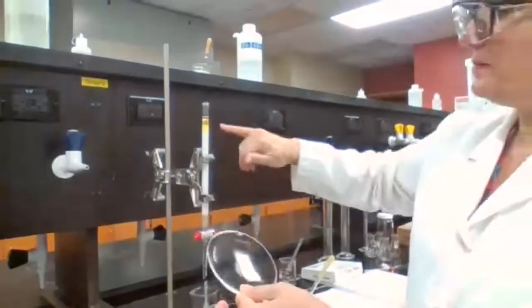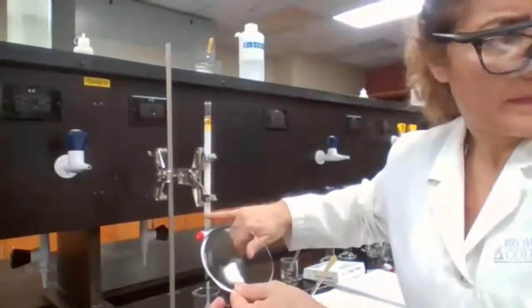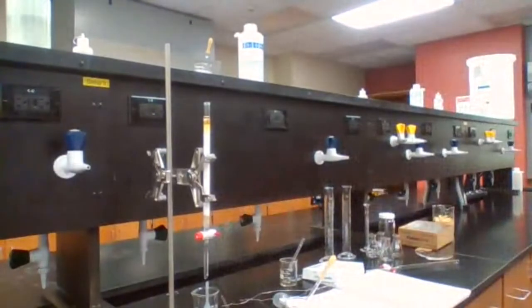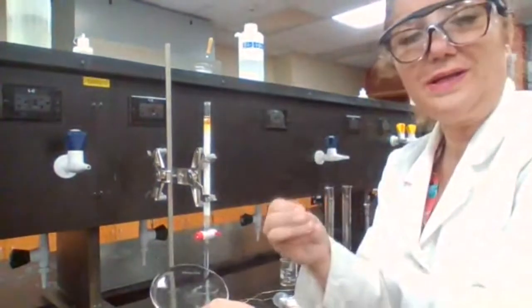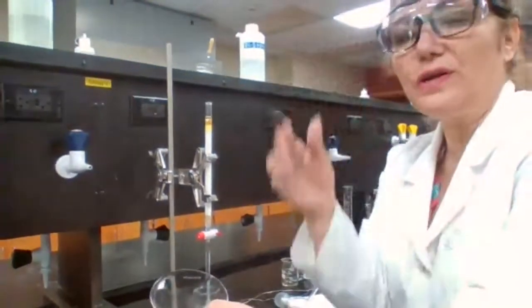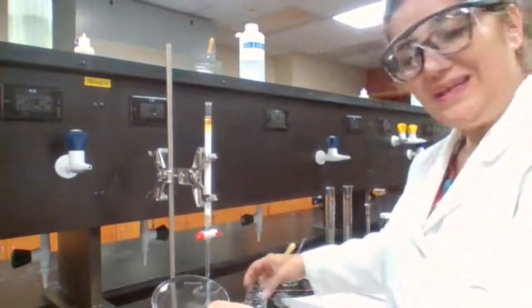If my compound 1 reaches down, which is fluorene, fluorene is the first compound. So I have a fluorenone and fluorene mixture. Fluorene is non-polar. It will come down with hexane, but very slowly.